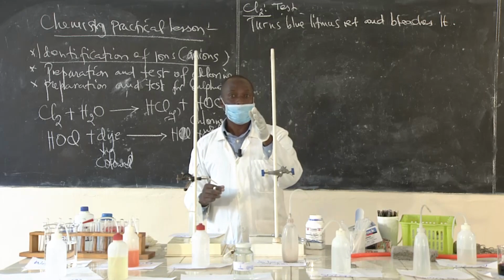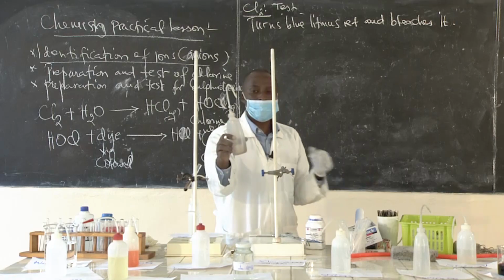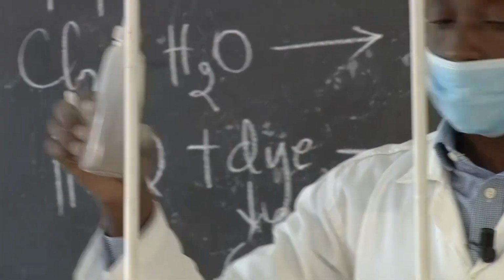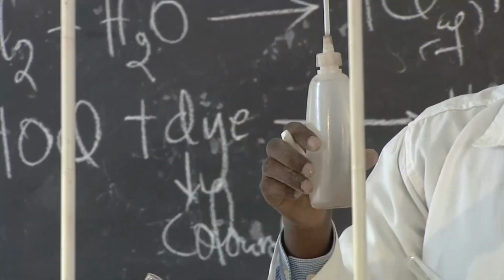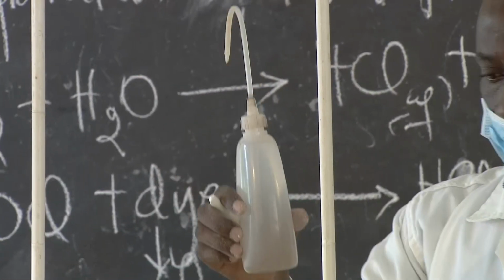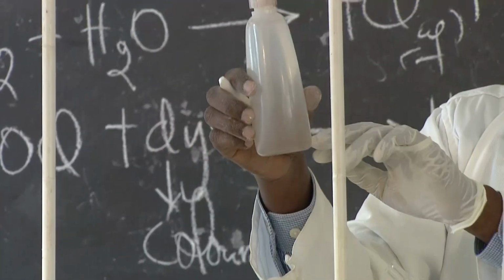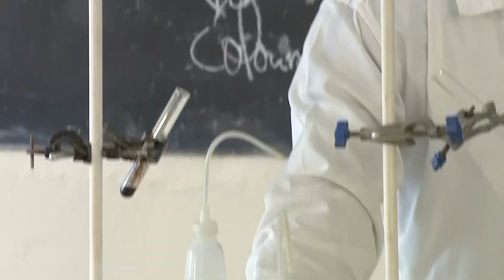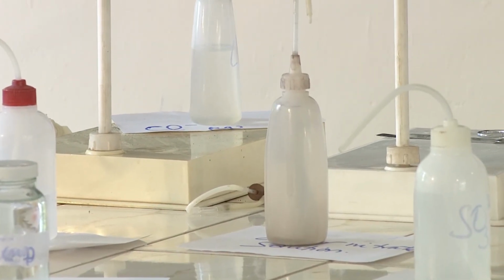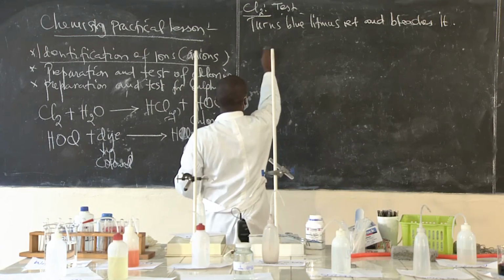Silver nitrate decomposes in the presence of sunlight. So that is why it is supposed to be colorless when freshly prepared. When it is exposed to light, it decomposes. That is the decomposition. So it decomposes to silver, and then the nitrate ions. So that is why it is not purely colorless, but still, it is still working. So we are going to test for the chloride ions.